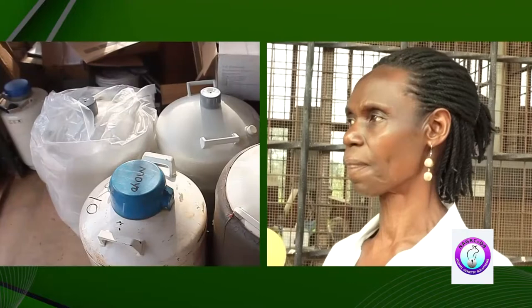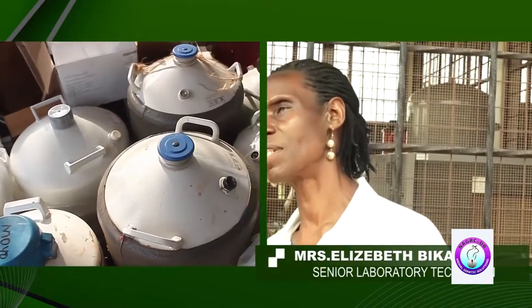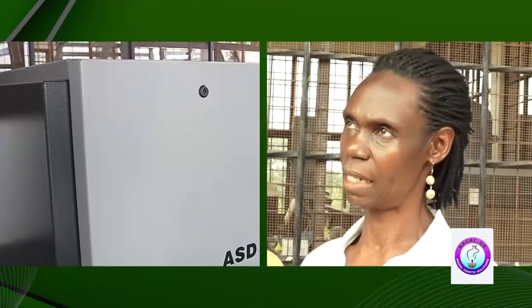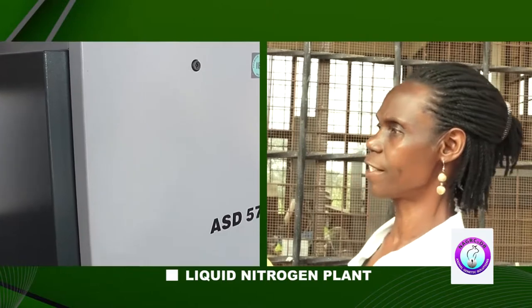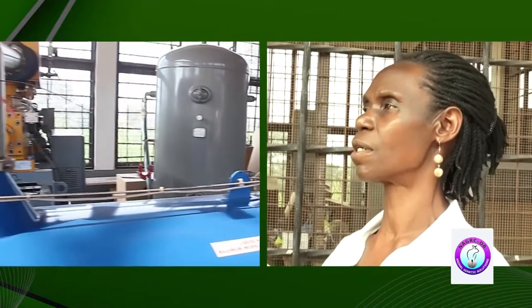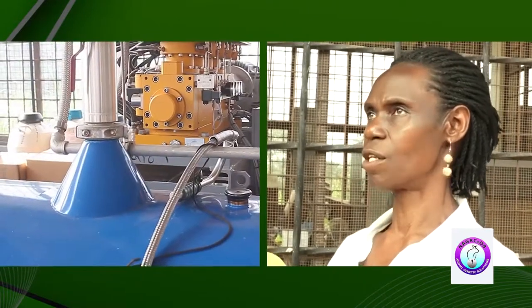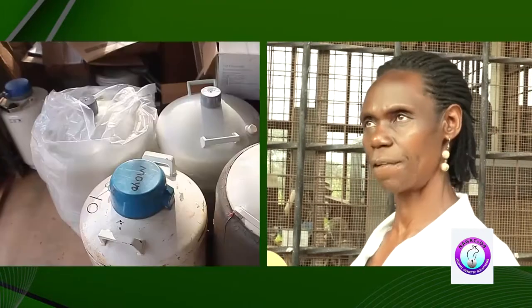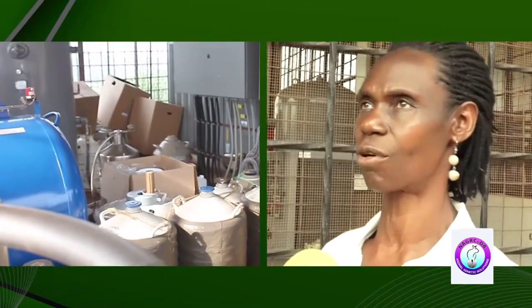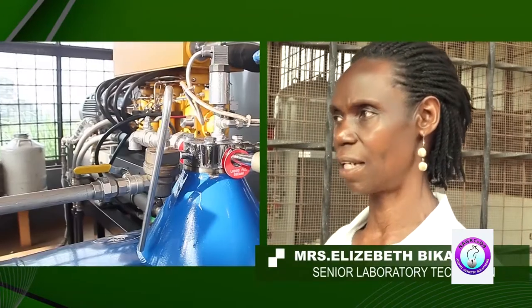This is a liquid nitrogen plant. First of all, nitrogen is got from atmospheric gases, whereby we have oxygen, carbon dioxide, nitrogen, and inert gases. So we play around those gases with a machine. It starts from the compressor. The compressor pulls inside, sucks in all the air, including the gas and the water, that is the humidity. It removes dust, feathers, because there is a mat that separates the gas from the dust and the insects and so on. So we have a bit clean air that goes inside.